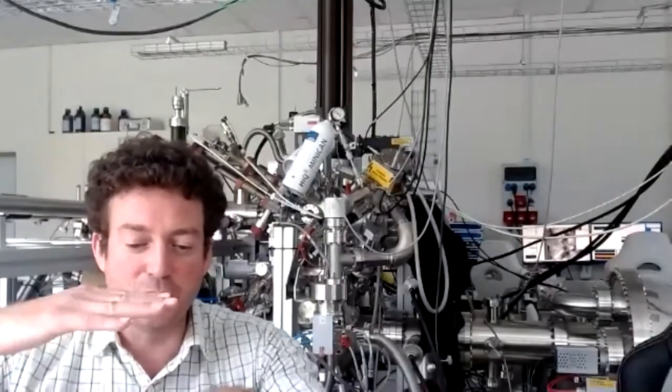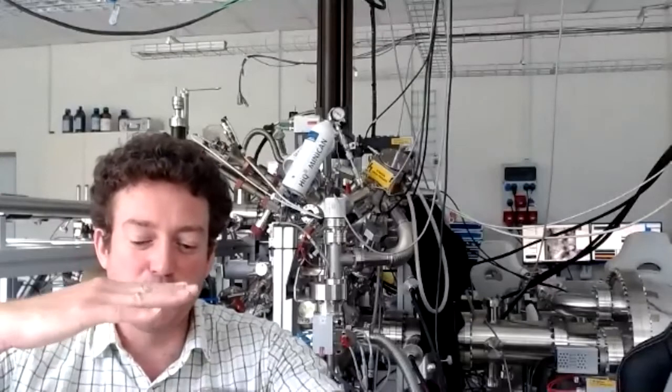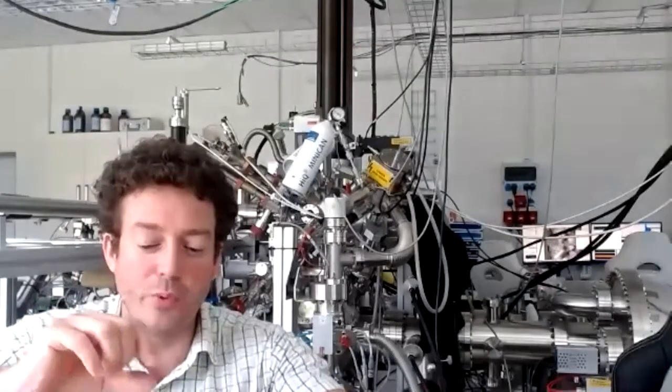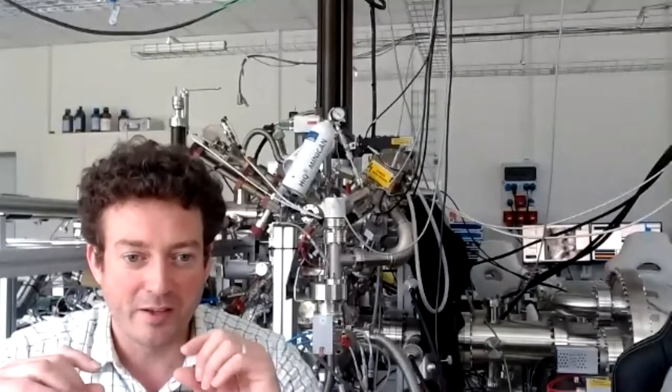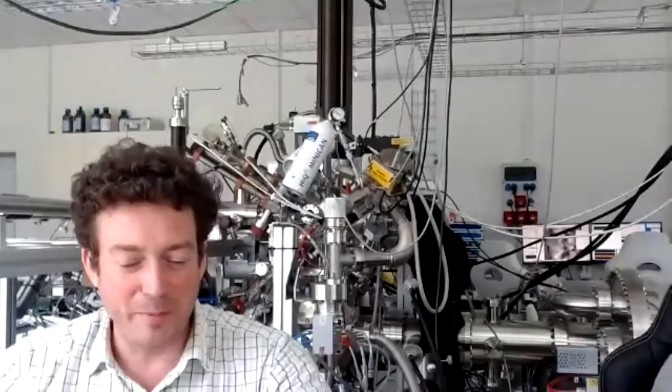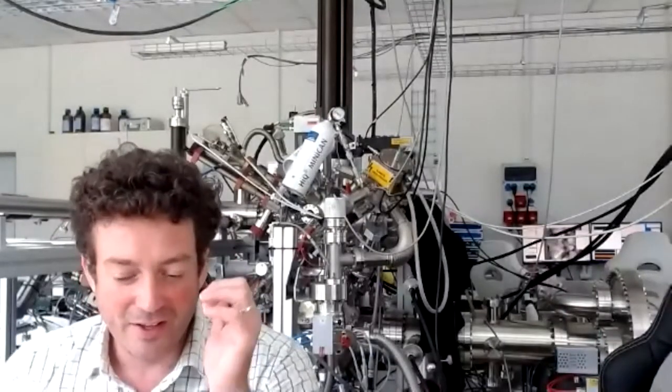However, our colleague has two of those sample holders connected with metal spacers, and there is a hole, and he puts a sample in. We were quite surprised, because when they were buying this STM machine, 2 or 3 years after NAPXPS, we expected that everything would be compatible. And after it was built, we realized that actually it is not. Okay.